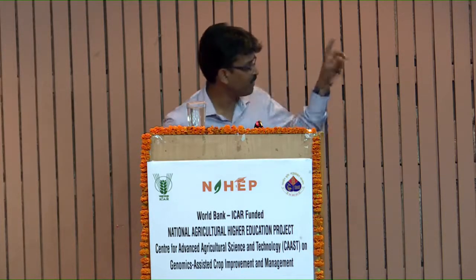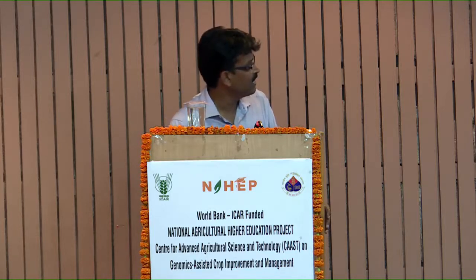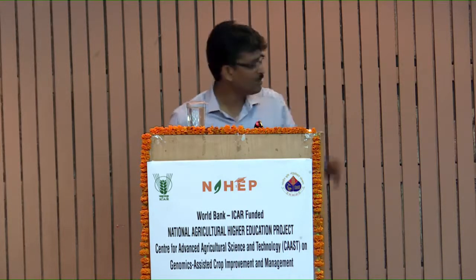So a lot of physics and chemistry are involved there. Light, fluorescence. Please read that. Okay. So FRET and non-FRET quenching. Finally, what happens is the fluorescence activity of the chemicals given here is quenched with the help of the quencher. That is explained by two mechanisms. One is FRET mechanism, another one is non-FRET mechanism. It's not a big deal. You just need to understand dipole-dipole interaction. If you understand that, you got the answer, right?